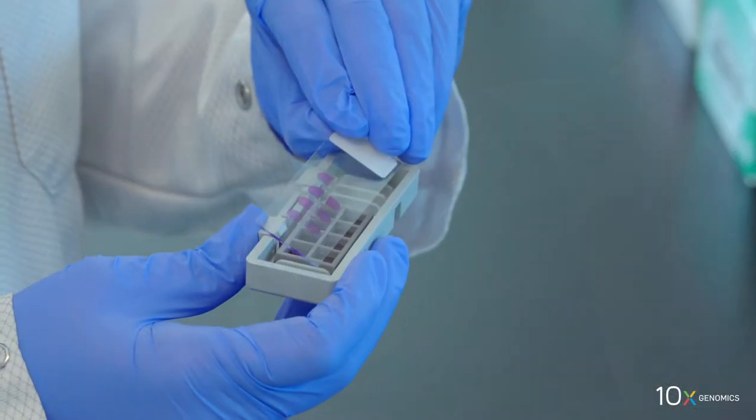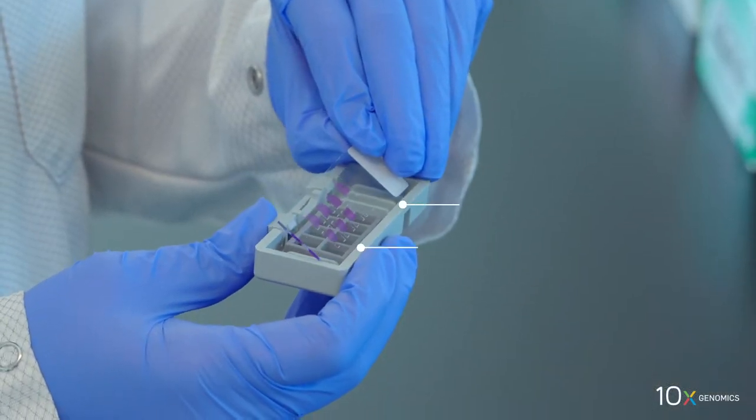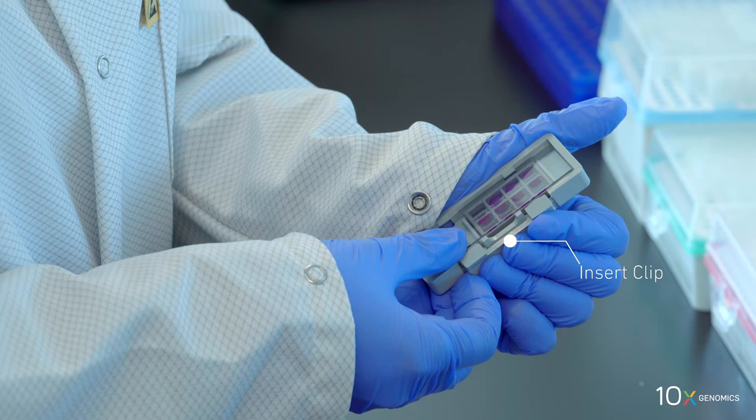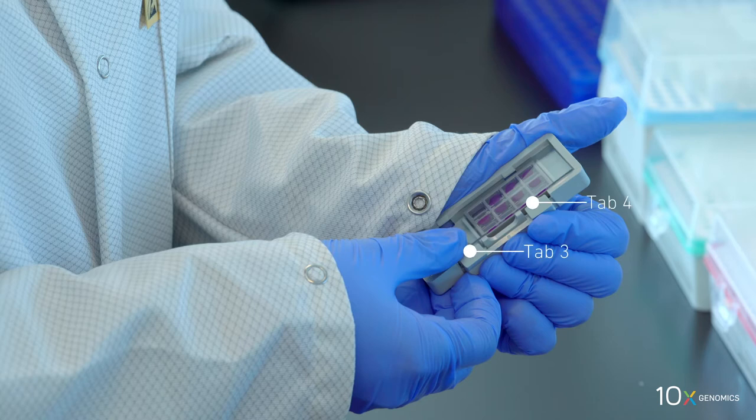Insert the slide under tabs 1 and 2. Ensure that the long edge of the slide is flush with the side of the slide cassette. Press the insert clip very firmly by applying even force on the lower part of the insert clip. Press down on the slide with a finger in between tabs 3 and 4 until the slide is under each tab.